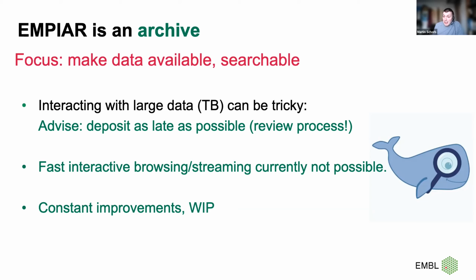Fast interactive browsing and streaming modes are currently not possible with that type of data. And again, this is for technical reasons. I think in the next talk covering new generation file formats, you will hear about our approaches on handling this, and maybe this will in the future be integrated. But you really need to make sure when you upload your data to EMPIAR or to one of these archives, it's really about the archiving. It's really about the data being accessible.